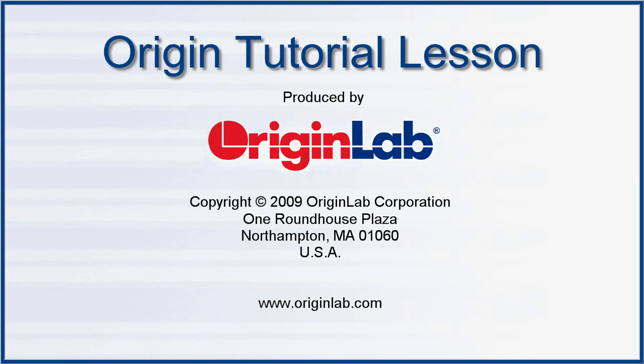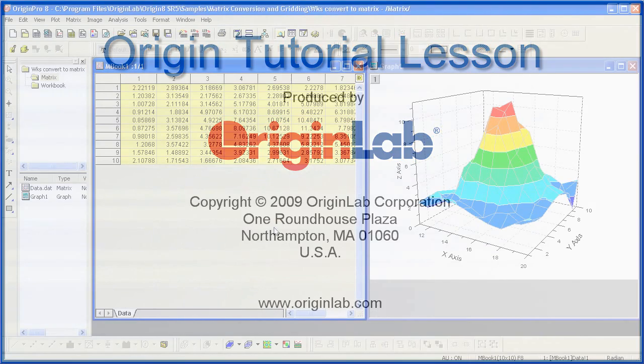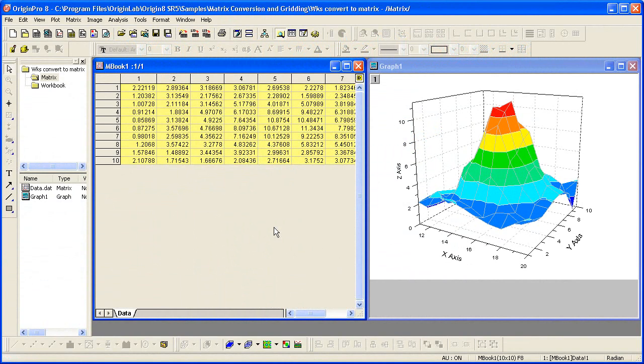In order to make many 3D plots in Origin, such as this color map surface plot, you need to have your data in a matrix window.